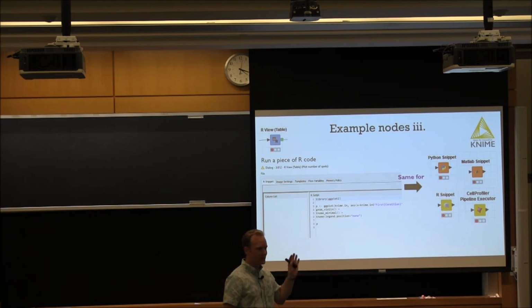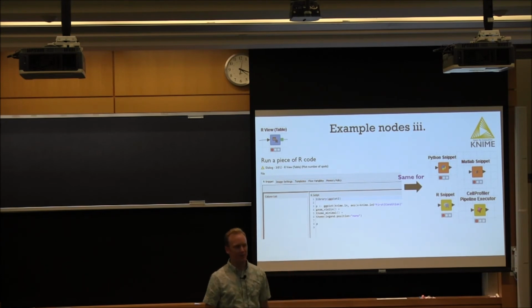And there's a large community for KNIME now that's coming for image processing. But I haven't tried LabVIEW.